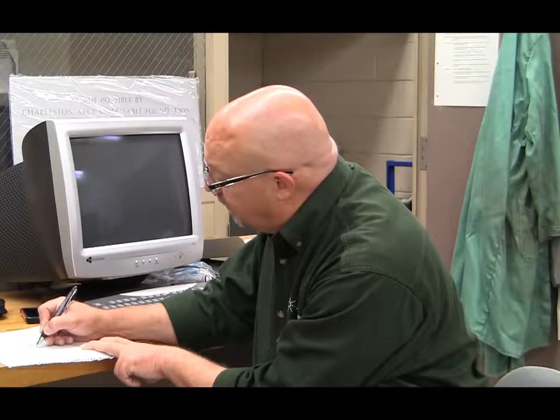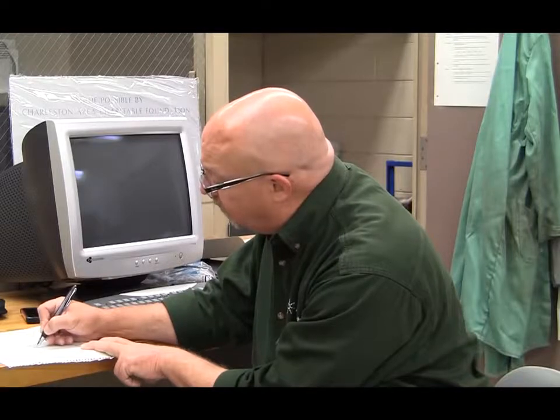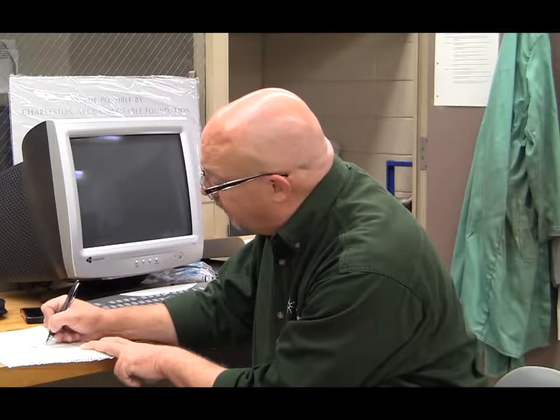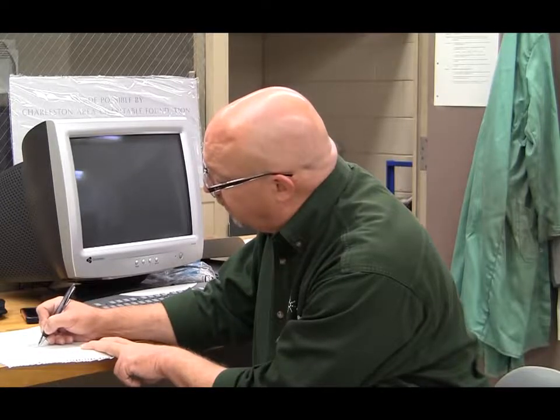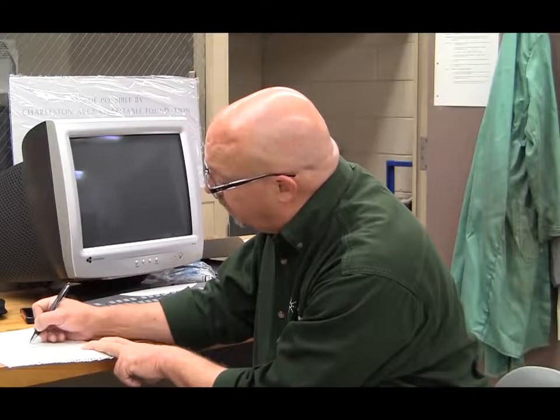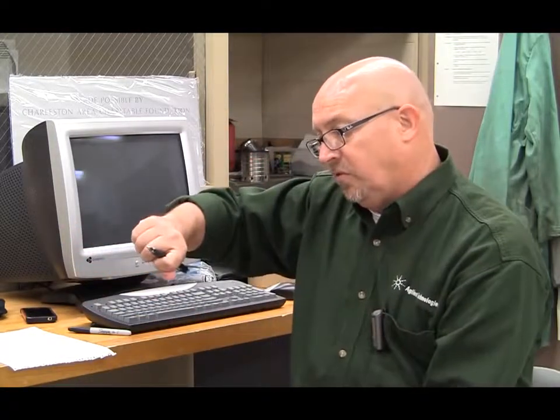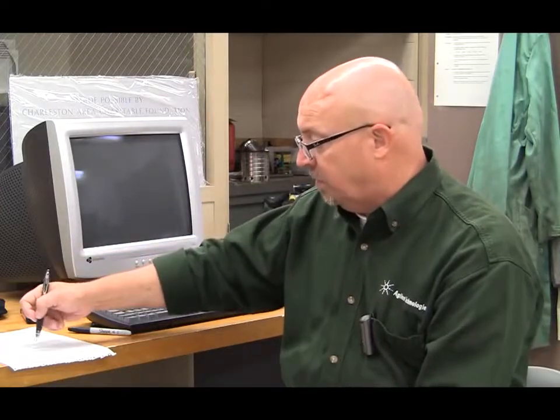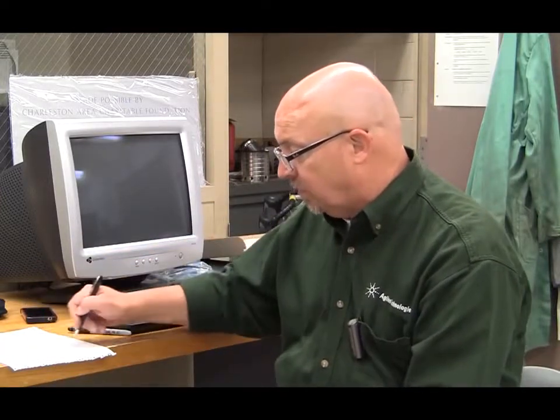In this case, there's a dual fitting here, so maybe a little too small. It'll come back out of this and down into those two splitters that go to the two columns. But they'll also have a line that comes in here. That's your sample line in from the back. So if you switch it, you have the ability to make an injection from the back that then goes through these capillaries, or to close it and go this way and go through this capillary. That's what we want.